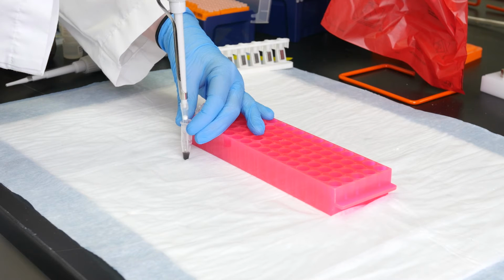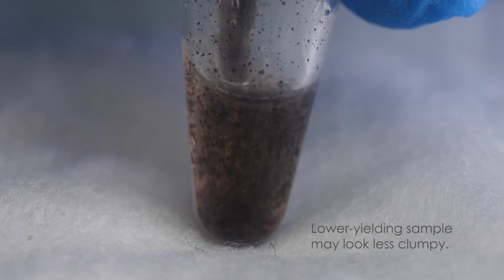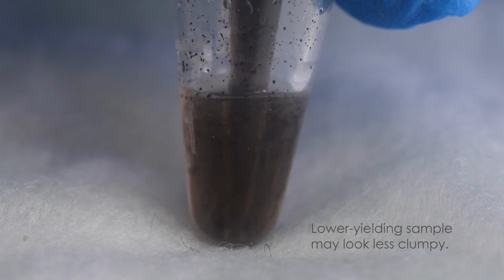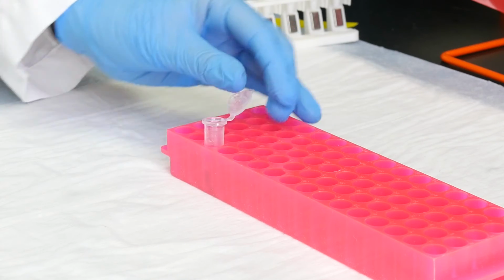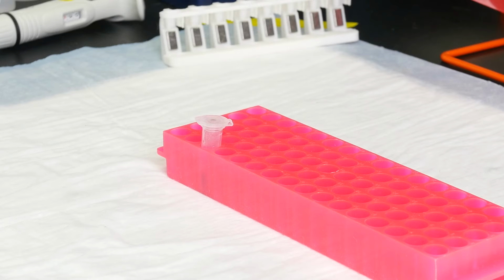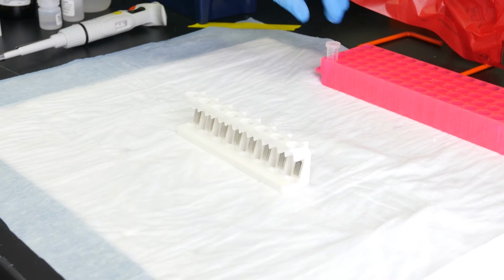Then, add an equal amount of ethanol. The texture of the beads will change, indicating that RNA is bound. Some protocols might ask you to use an 80% ethanol solution called binding buffer. The ethanol opens up secondary structure and is necessary for total RNA isolation.